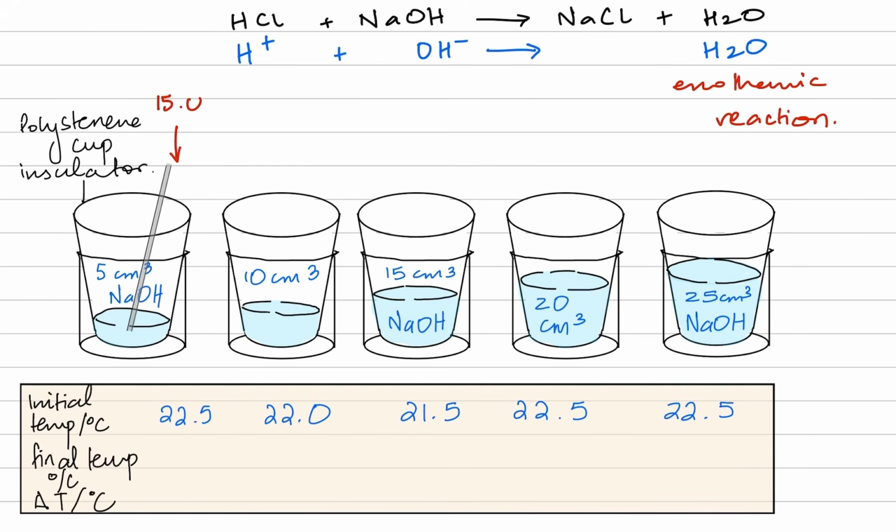Now I am adding 15.0 cm³ of HCl in each container. This is the same concentration and volume of the same acid. Obviously we know that in some cases the HCl will react fully, or in some cases the alkali won't be enough to completely neutralize.